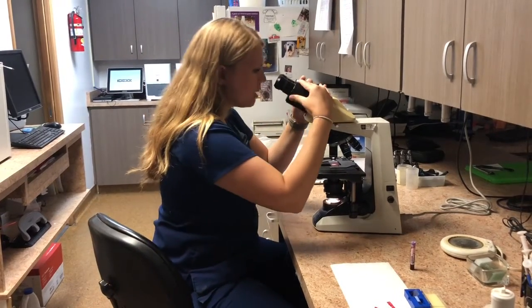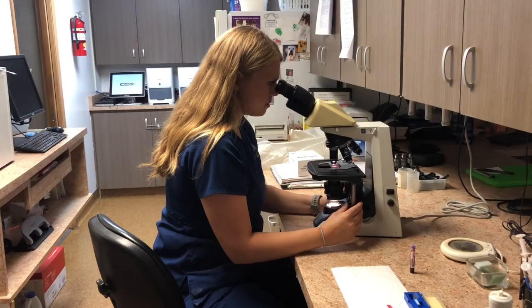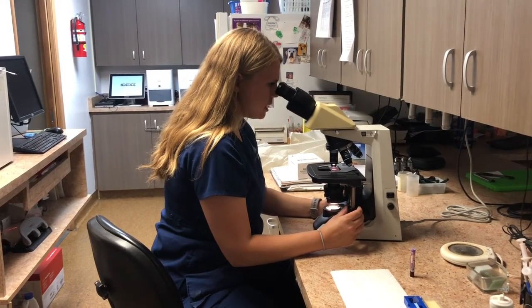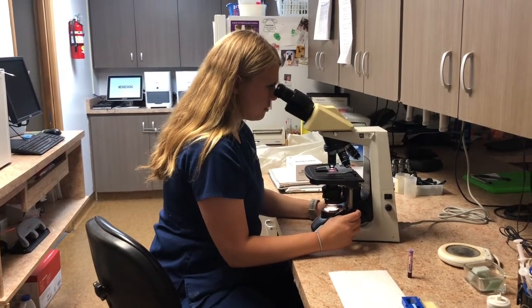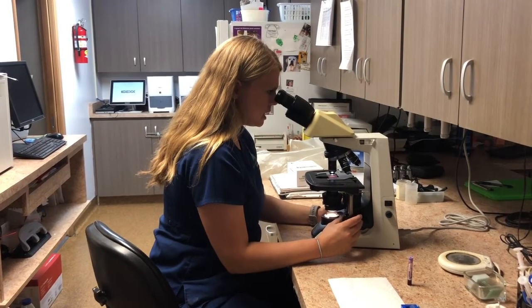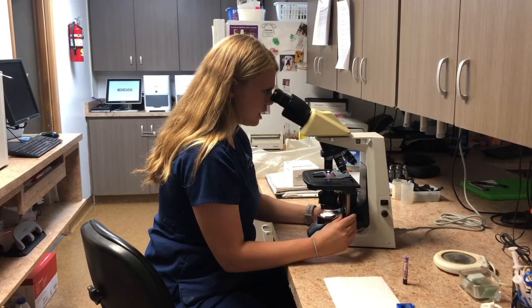Get this set up. And then once I get in focus, I'm going to go through kind of like a grid pattern, looking for the microfilaria. They'll typically be stable but kind of writhing around on the microscope slide.